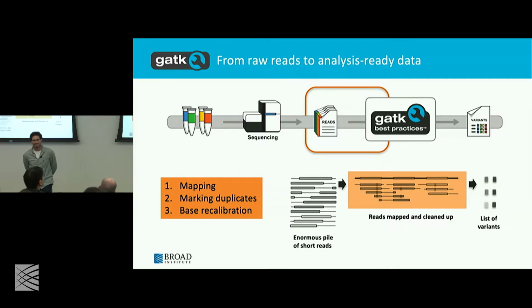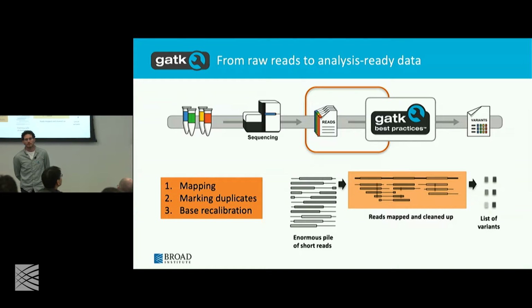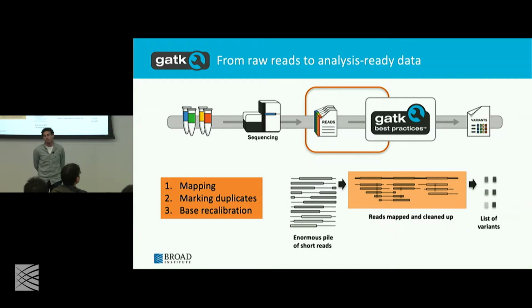So it may calculate coverage. The duplicate doesn't count, right? If the reads come from one molecule, it only counts one, right? Right. So let me repeat the question. The question is, when we estimate depth or coverage, do the duplicates count? So it really depends on how you run the tools, but most tools' defaults are so that they ignore duplicates. So if you ran mark duplicates and you've marked duplicates, then the downstream tools, unless you try hard, will not count duplicates.